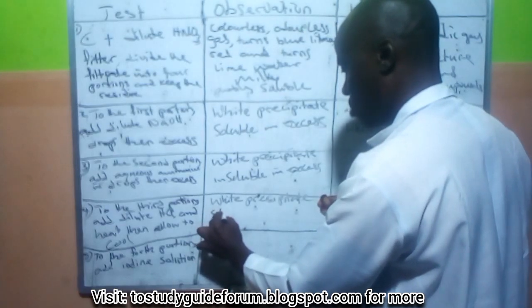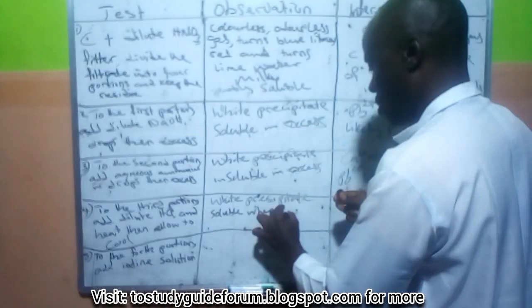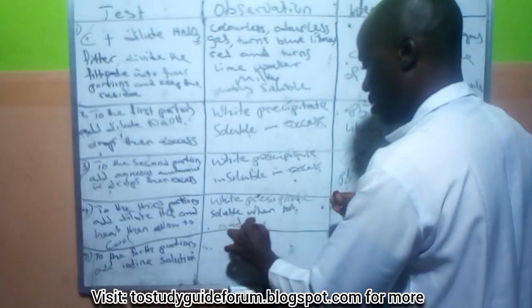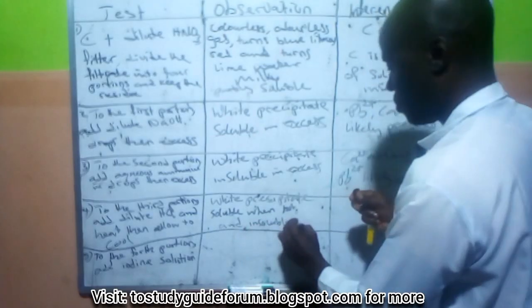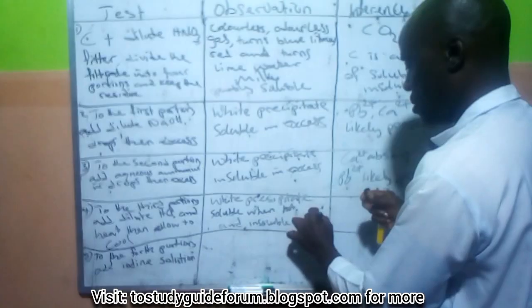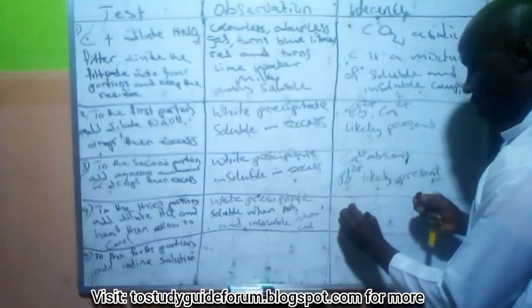Soluble when hot and insoluble when cold. What do we have here?